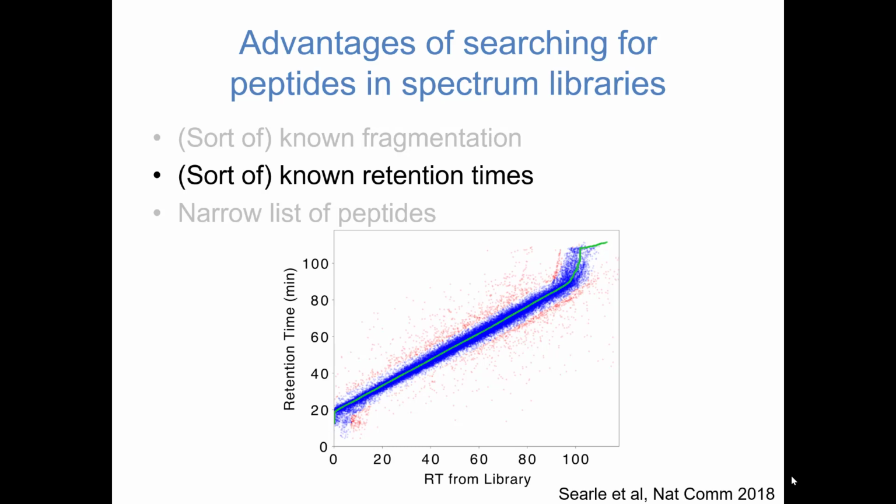Right, but that's actually in a different precursor isolation range typically. So like a phospho, you would think of it in a different way. Now that is certainly an issue for other sorts of peptides. Oxidized peptides will fit potentially in the same precursor isolation window. And I don't know if Mike is going to show the slides, but oxidation. Yeah, I know. So tomorrow you get to see some stuff around that.